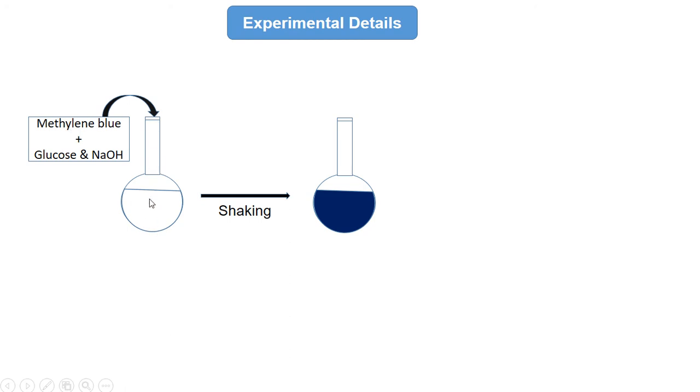Okay, then you shake for few minutes, and after that if you leave it, then that solution will be colorless. But if you shake that solution it turns blue.